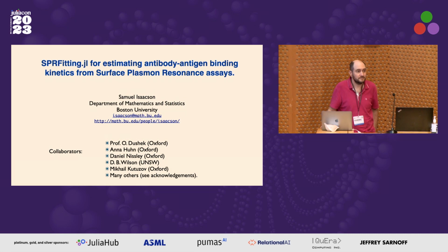Thank you for the nice talk. It's a neat little trick that you did there. I was wondering, is the data that you're comparing to spatial? Nope, not. SPR just gives you a measure for the amount of stuff bound across the surface. So did you try simplifying your spatial model back to multi-compartment ODEs or something?